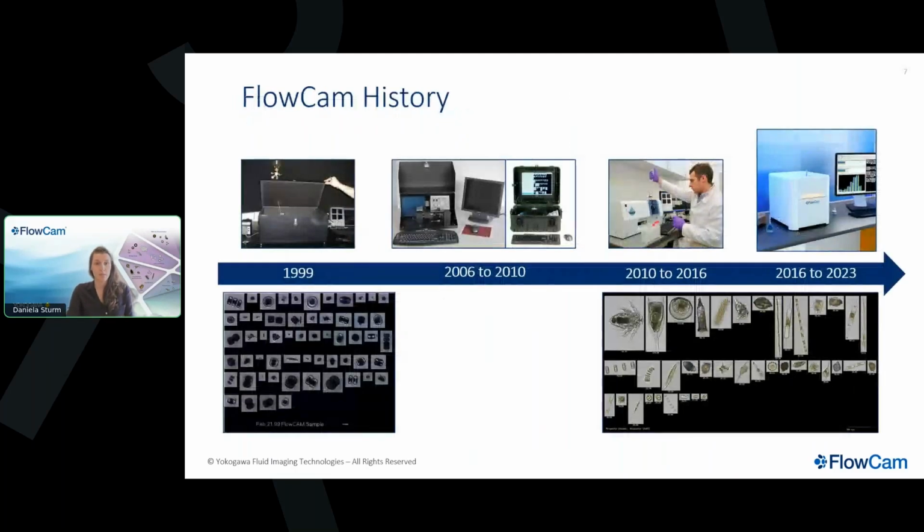And some of you may have seen an older FlowCam in a lab or at a conference at some point. So I quickly wanted to show some of these instruments as well. And I think this also really illustrates the advancements in image quality since FlowCam was first developed.